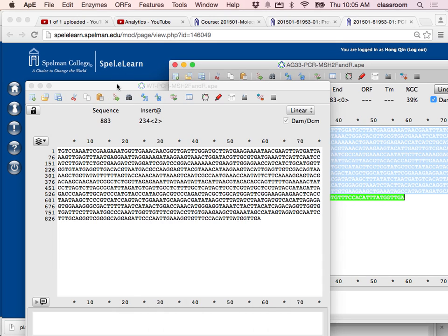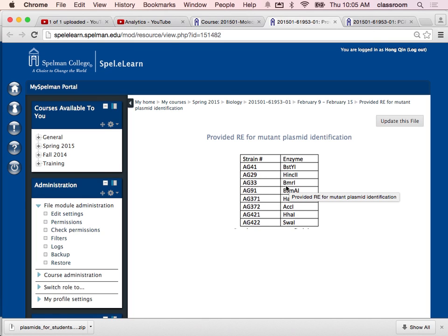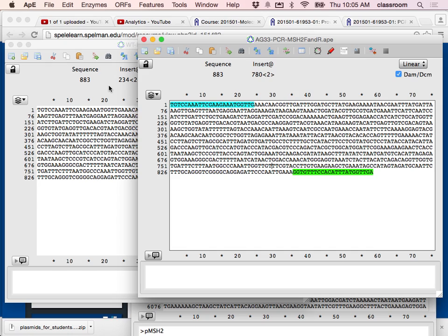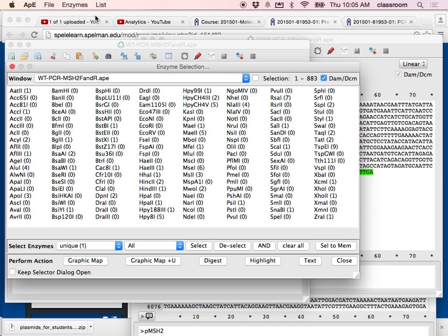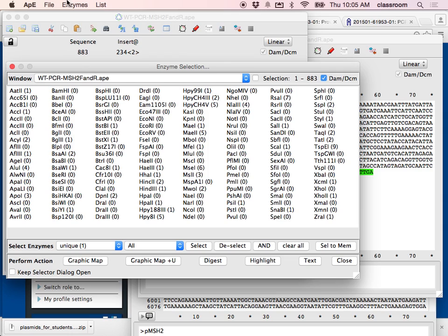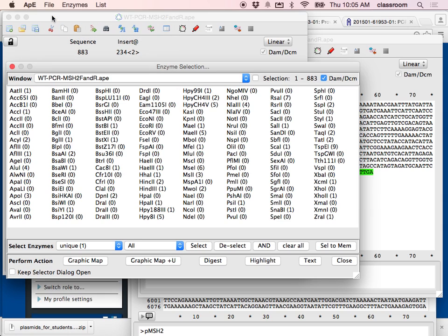For AG33, I go back to Moodle to look up the enzyme — AG33 uses BMR1. I need to find this BMR1 enzyme to cut the plasmid fragment using APE. BMR1 is not a very common enzyme so it doesn't appear in the APE default enzyme list. To find it, click on Enzyme Site, then New Enzyme, then open a new enzyme file.